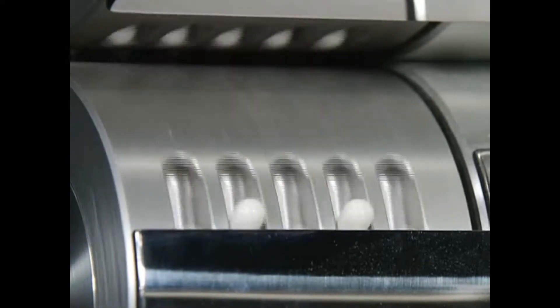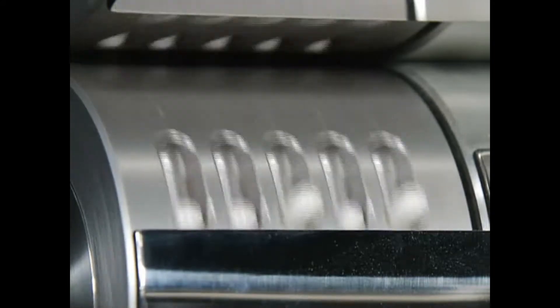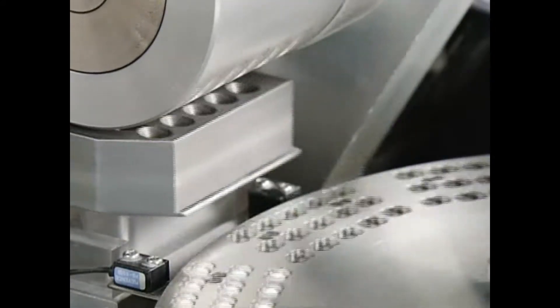Based on Qualacap's many years of experience, cavity pocket measurements are designed to prevent defects such as cracks, telescopes or dents.